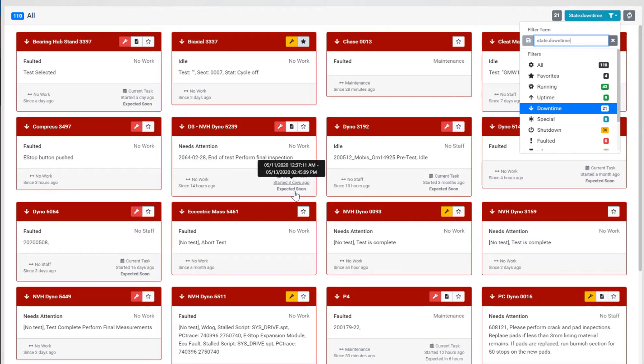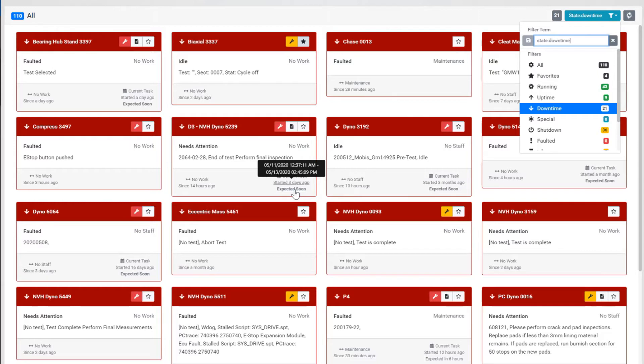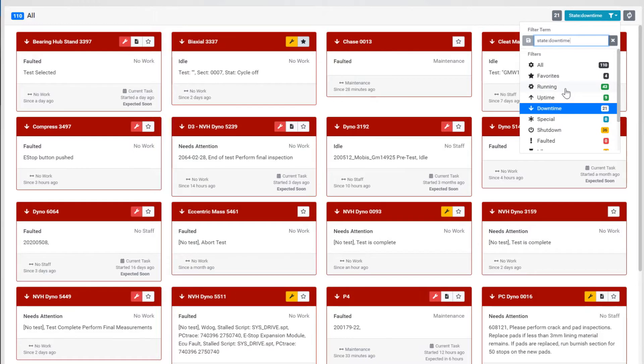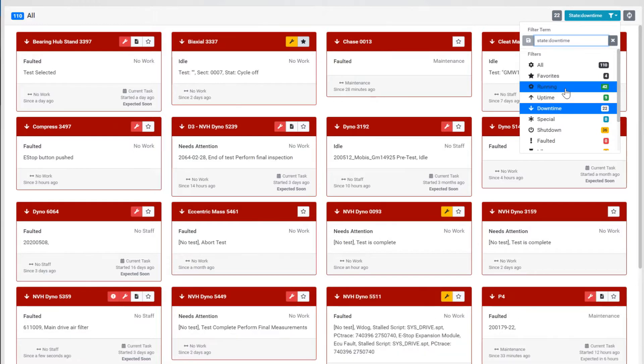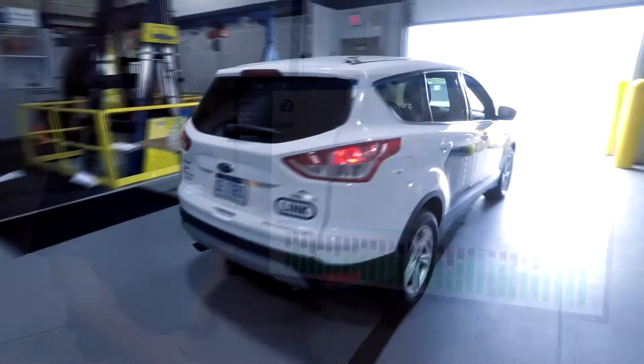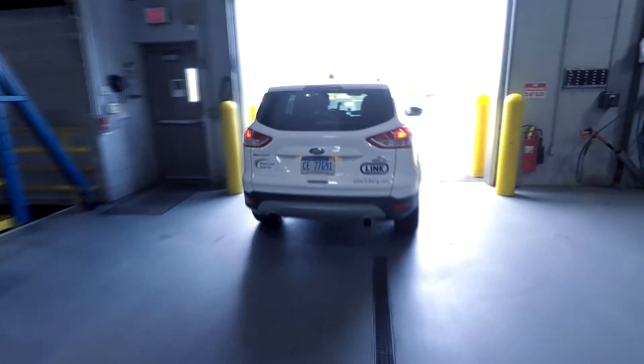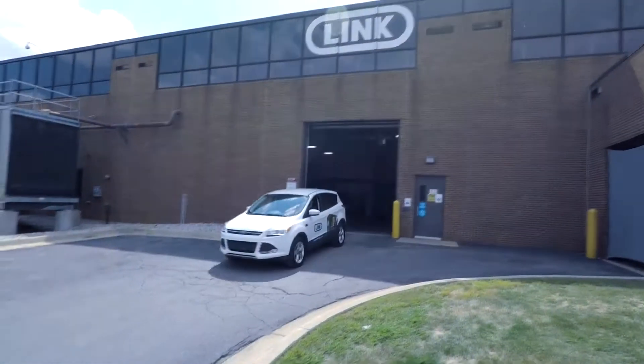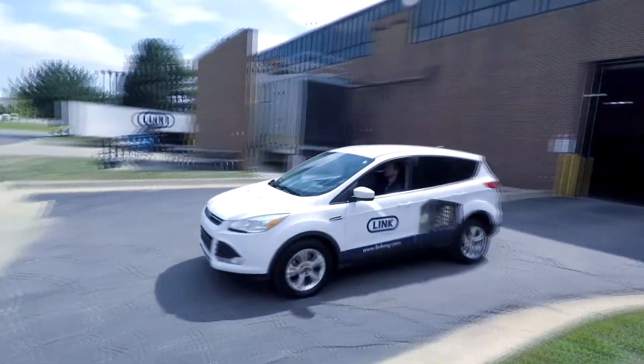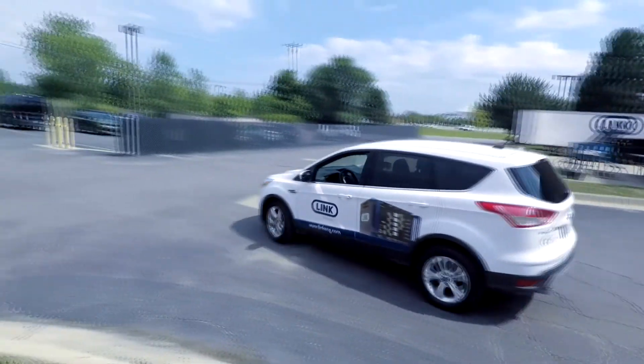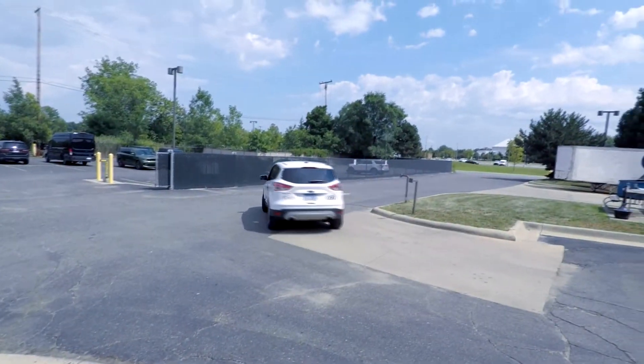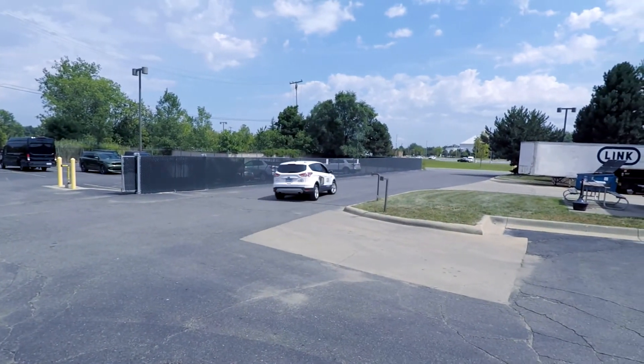The real-time status, utilization, and efficiency of several laboratories can be viewed through custom reporting with the ability to implement configurable alerts. Portable test system locations can also be tracked via GPS through a Google Maps interface.